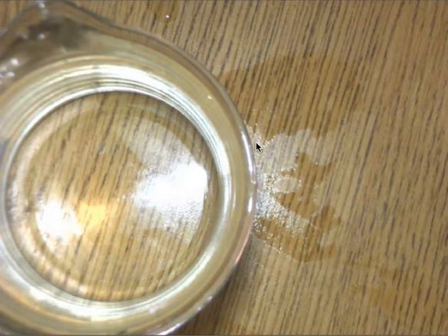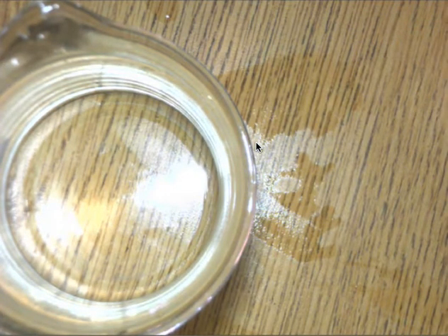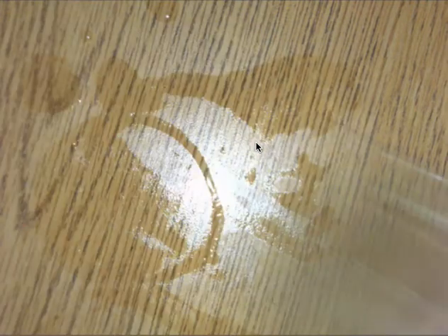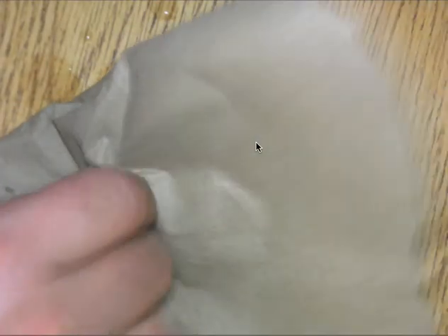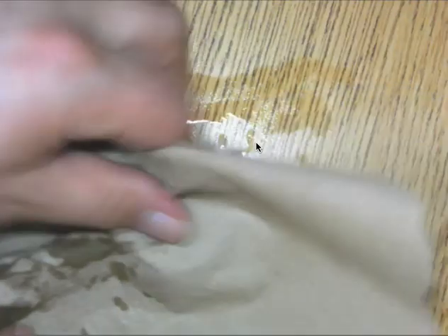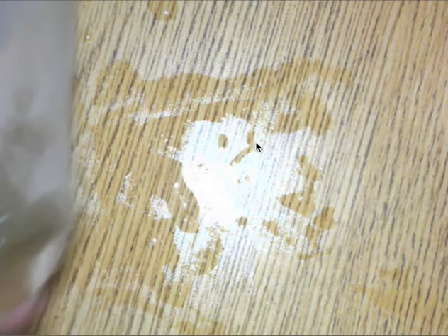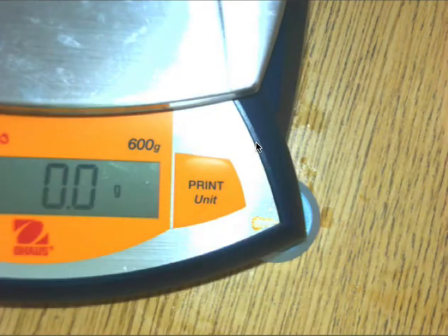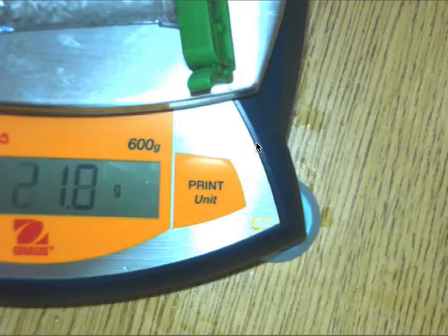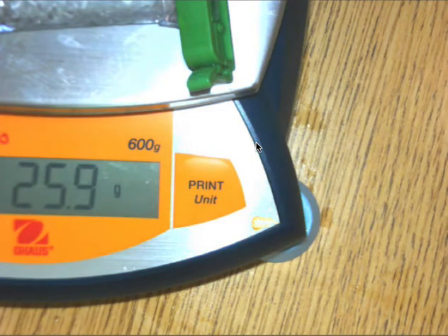Now it asks us to dry. Gently pat the tubing dry. Weigh your test tube. Weigh your tubes. We're going to dry it off here. Pat it nice and dry. So now it's nice and dry. We're now going to find the mass. Place it on here. So we have 25.9 grams.